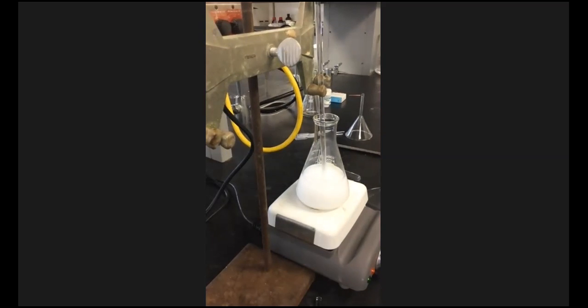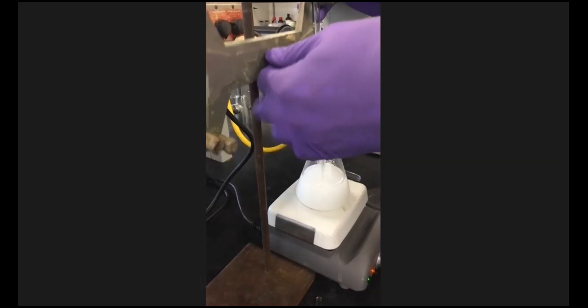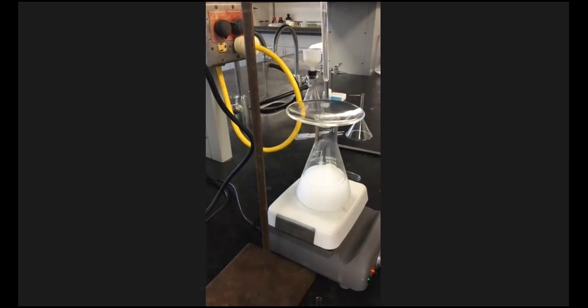All right, so right now the temperature is only reading 30 degrees Celsius, only 30. So I'm gonna warm it up a little bit more, to make sure the digestion goes to completion. And so I'm gonna turn the temperature up on the hot plate just a tad. Cover that back up. Still got 12 minutes.